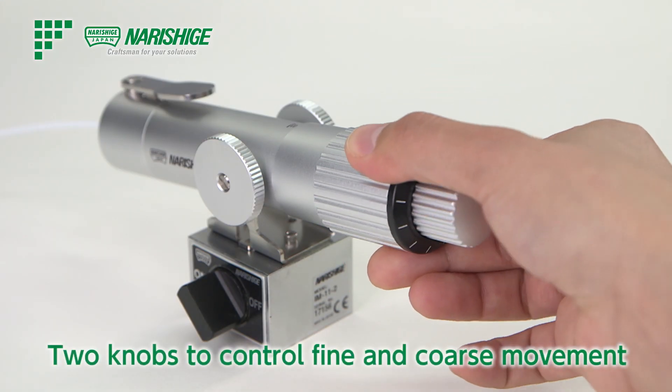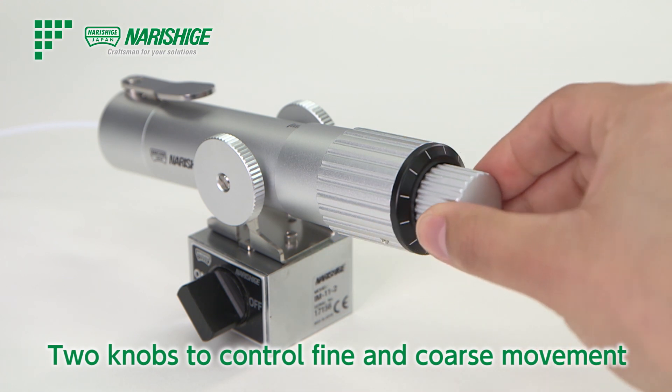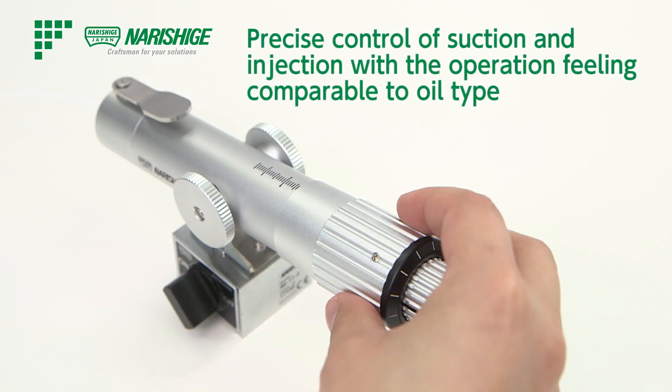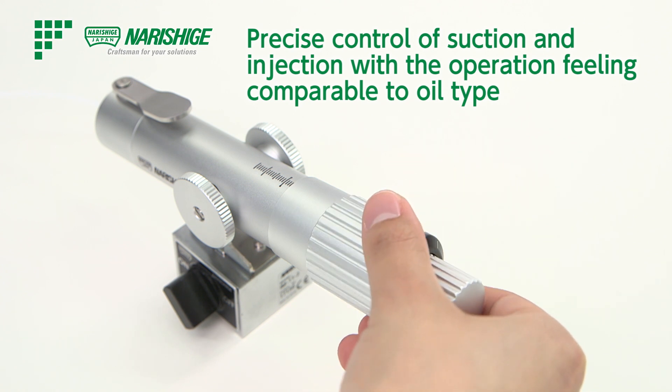The IM-11-2 has coarse and fine control knobs, whereby the user can choose according to the application. Operation is comparable to the oil type injector, so that injection and suction can be done with high precision.